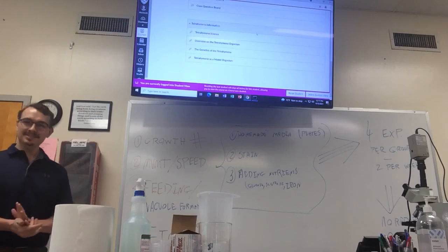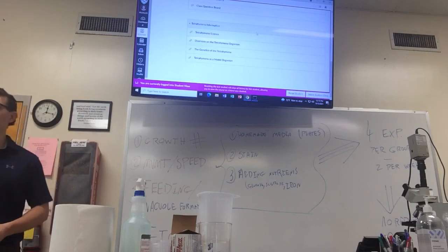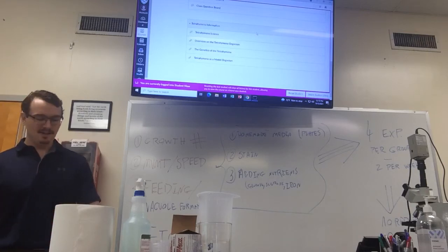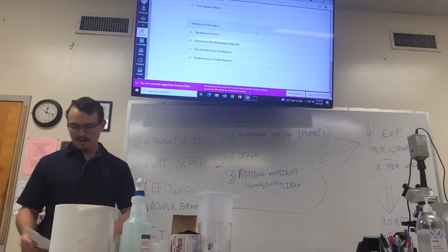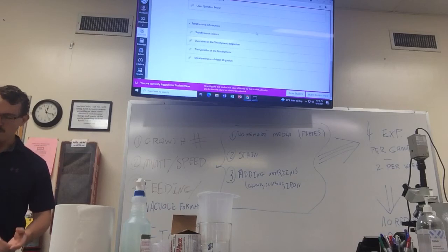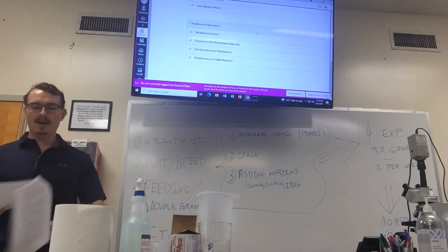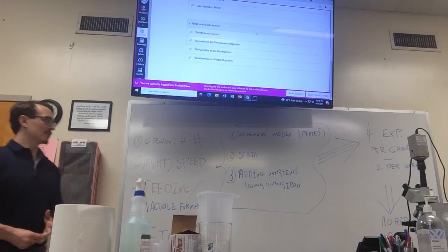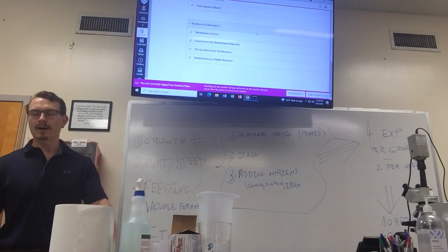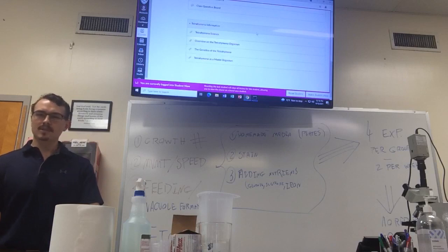Any more questions? Does each group have to come up with their own 4 experiments, different than all the other groups? Yes. And there are tons of things in here that tell you what affects them. You don't have to come up with your own. I'll just give you random examples, because I printed out one of the things. Somewhere in here it talks about using a skimmed milk media. You can figure out how to make that, or make a whole bunch of other medias. We have stuff you can add to them. Like I put on the thing, you could put glucose in some, sucrose in some. There are iron chemicals that we have, and they like to grow with iron, so we can put that in some. So it doesn't have to be huge tweaks in the experimental design.